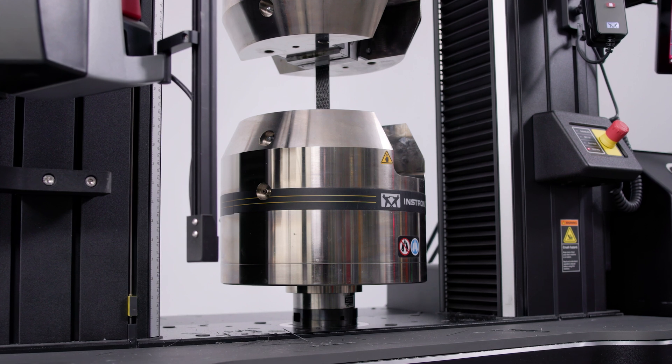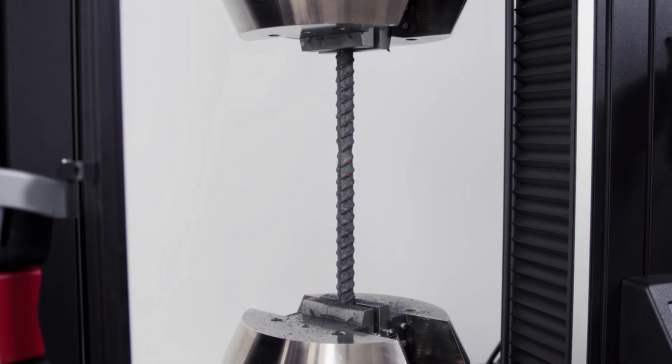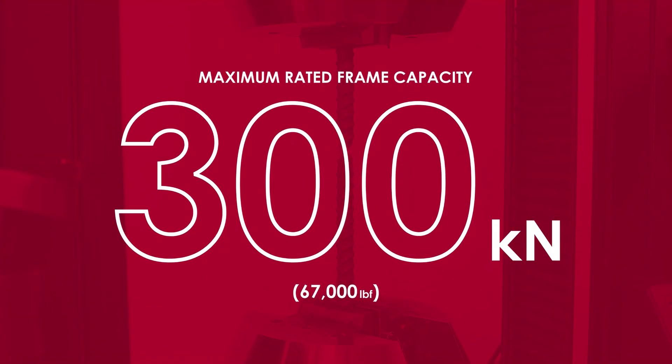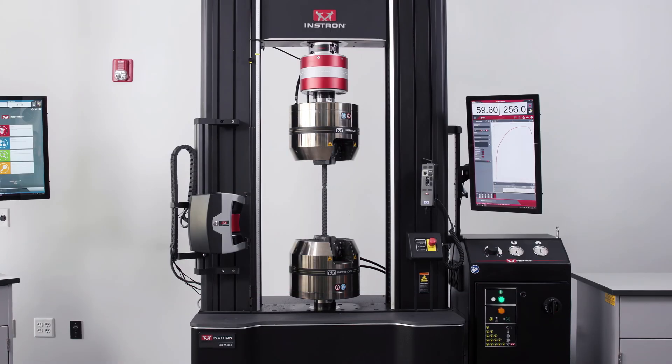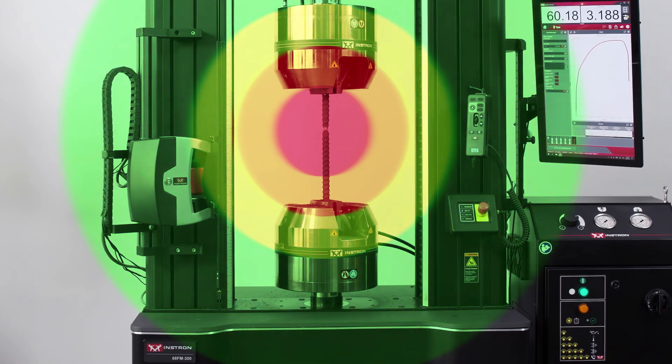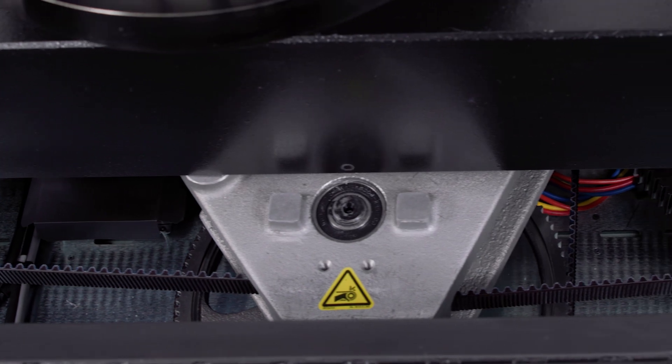The high-force systems are designed to withstand the shock and vibration resulting from continuous testing at the maximum rated frame capacity, which can be as high as 300 kilonewtons or 67,000 pounds-force. Control electronics have been isolated from high accelerations during violent specimen breaks, while critical mechanical components have been designed with shock in mind.